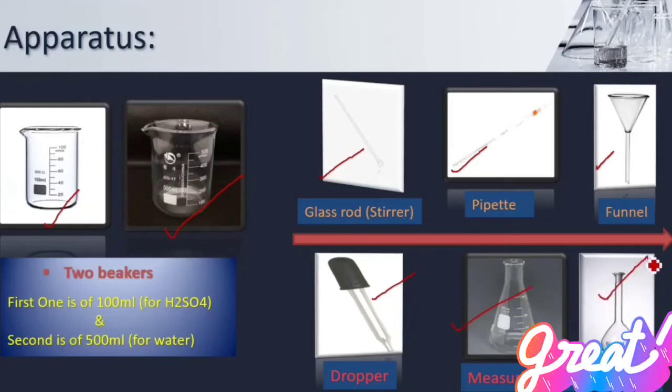and the measuring flask. Use this measuring flask always, and always cap it after use and name the solution you made. So the main flask of 500 ml is required.